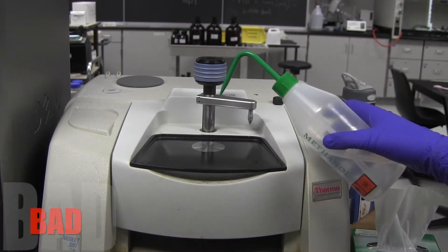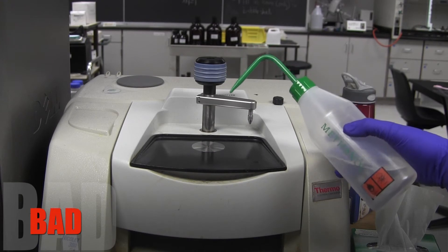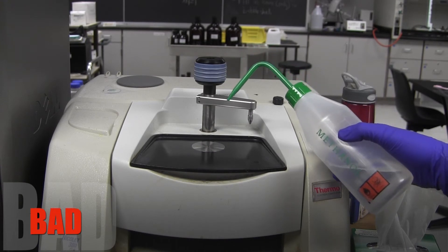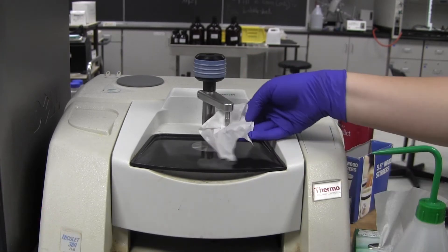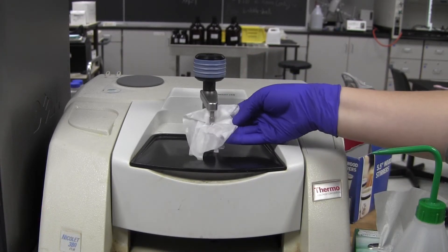Never squirt methanol directly onto the crystal. It will ruin the machine. Be sure to clean the end of the arm as well.